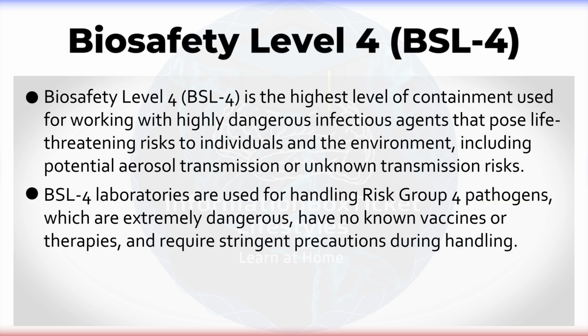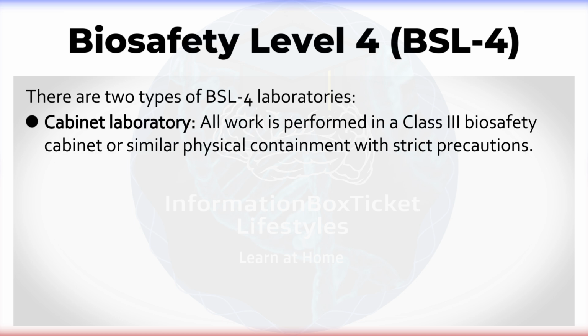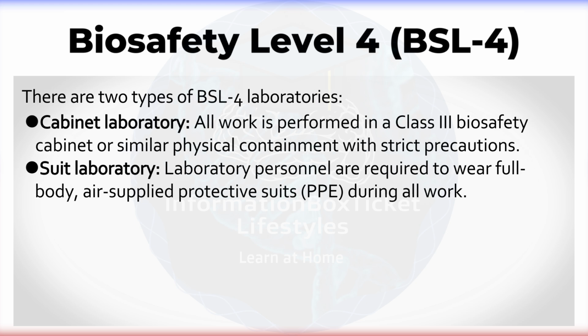BSL-4 laboratories are used for handling risk group 4 pathogens, which are extremely dangerous, have no known vaccines or therapies, and require stringent precautions during handling. There are 2 types of BSL-4 laboratories. Cabinet laboratory. All work is performed in a Class 3 biosafety cabinet or similar physical containment with strict precautions. Suit laboratory. Laboratory personnel are required to wear full-body, air-supplied protective suits during all work.